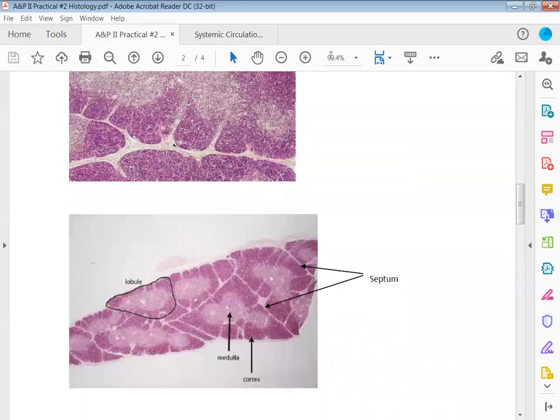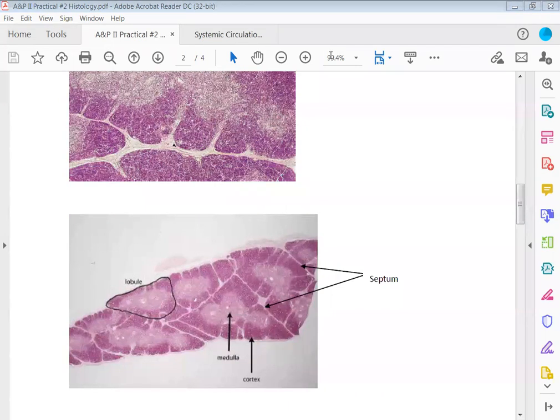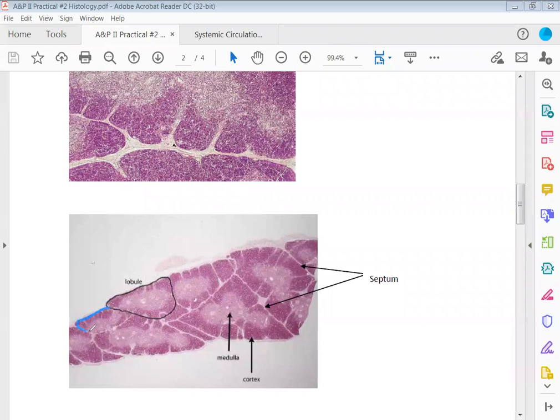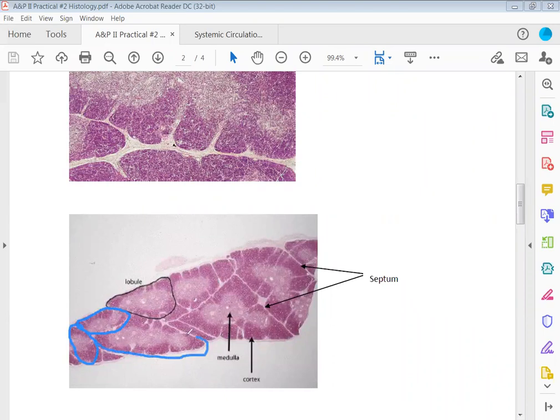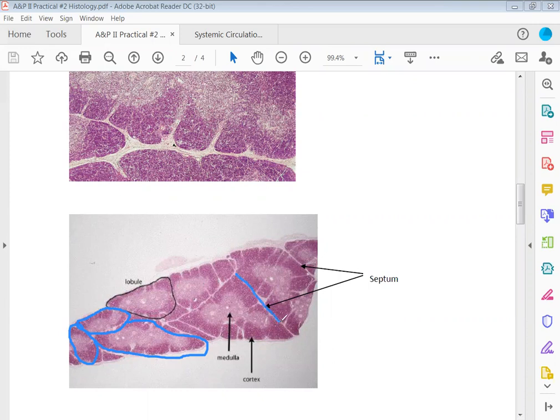These structures here that I'm circling in blue and that's already circled in black, that would be a lobule. Each one of these areas is a lobule. Then the lobules are divided by these white dividing line structures here. These white dividing line structures are called the septum.